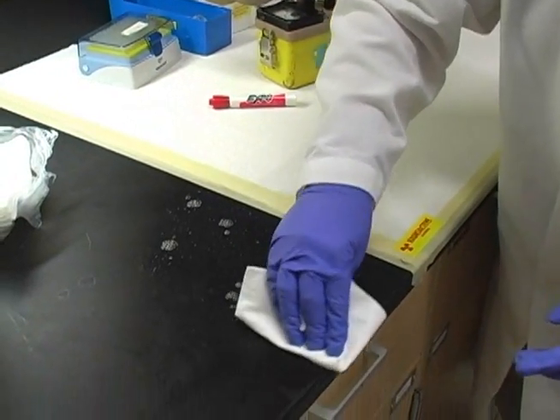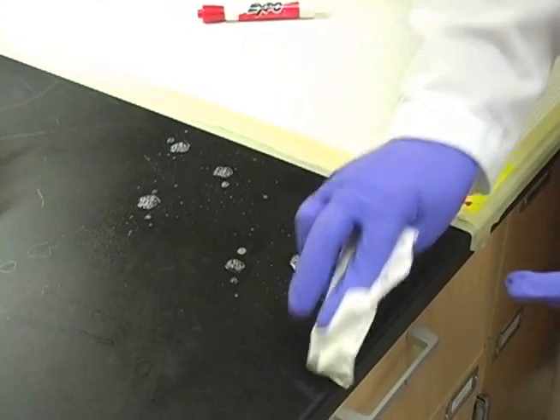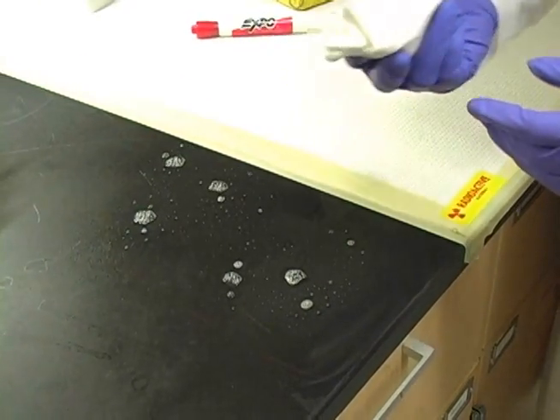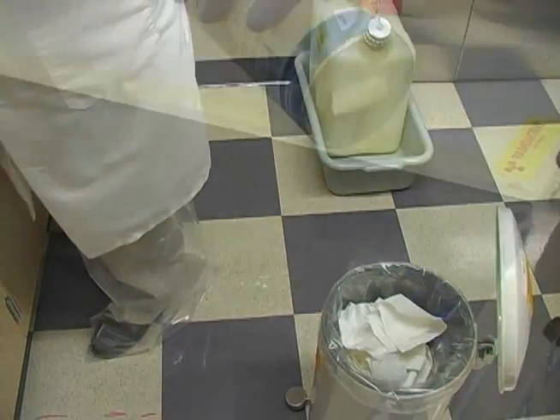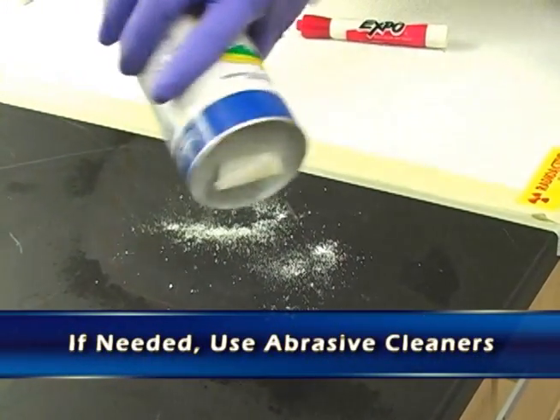Here we're looking at the bench top now, doing the same process — cleaning a small area and verifying with the meter whether or not material is coming up. If it's hot, we do it again. Some areas may need a little bit of an abrasive cleaner like Comet or something.